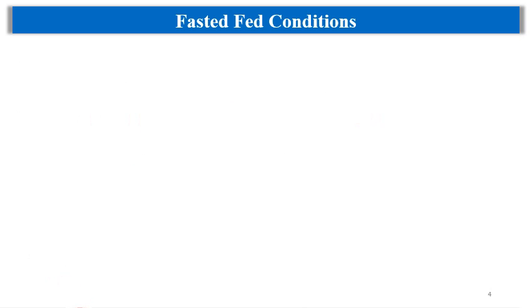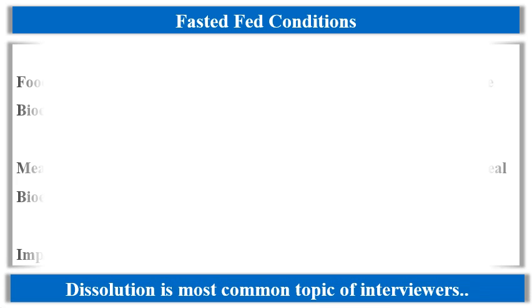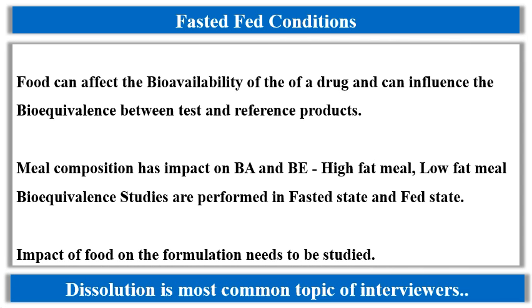Then we have to understand the fasted and fed conditions. What are fasted and fed conditions, and what is the importance of these conditions? See, food can affect the bioavailability of the drug, and it can also influence the bioequivalence between test and reference product.